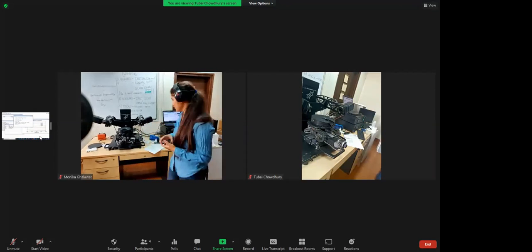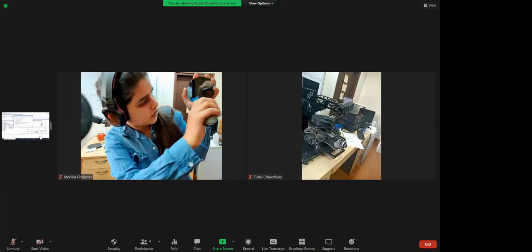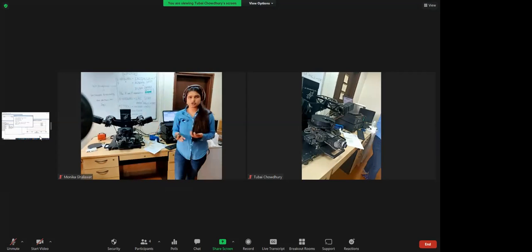Okay, I will show you one more. Only a visible spot, just to see with the naked eye. Actually, due to the camera, you cannot see. Okay, it's slightly visible. Fine. Then you can say your substrate, your film, is optically smooth.